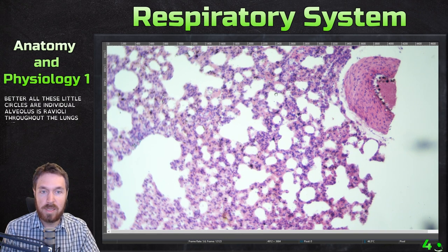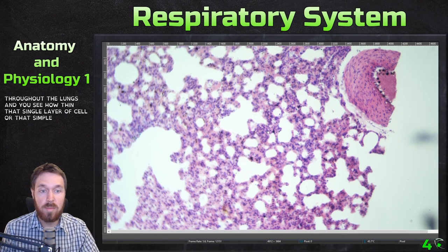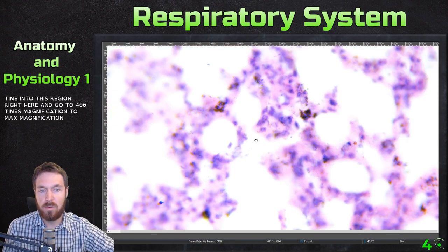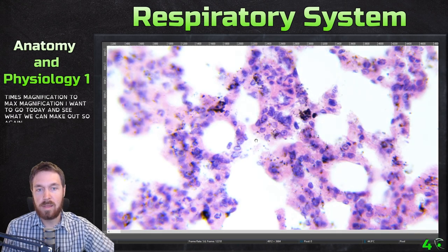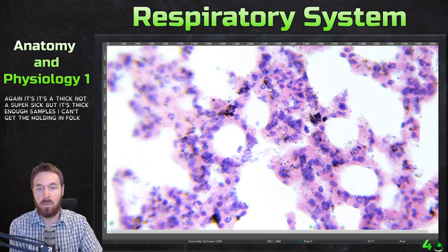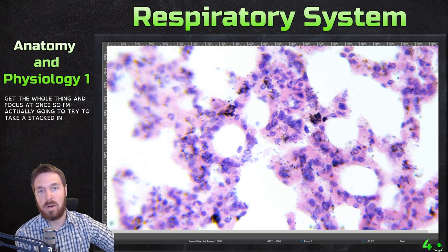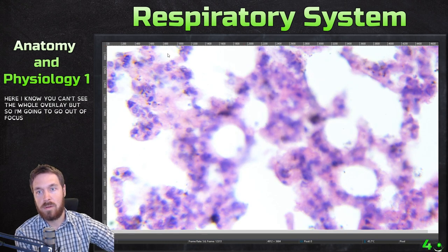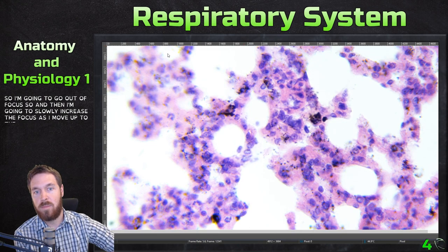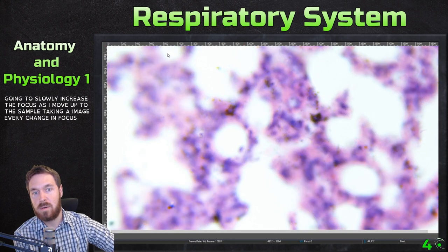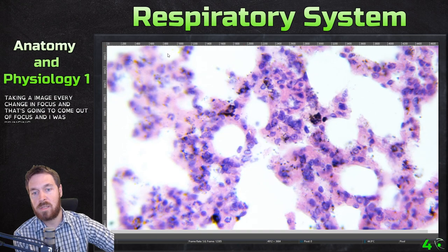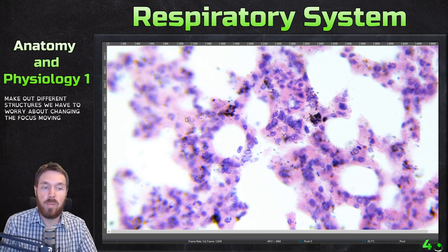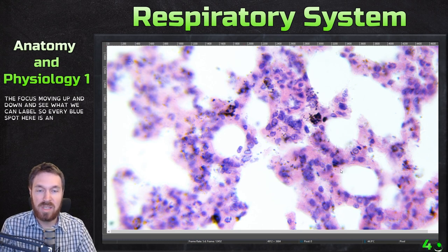You can see how thin that single layer — the simple squamous epithelia — really is. Now I'm going to zoom to 400x magnification and take a stacked image, since the sample is thick enough that I can't get it all in focus at once. I'll go out of focus and slowly increase focus as I move up through the sample, taking an image at each focus level. Every blue spot here is a stain for nuclei, which is pretty neat.